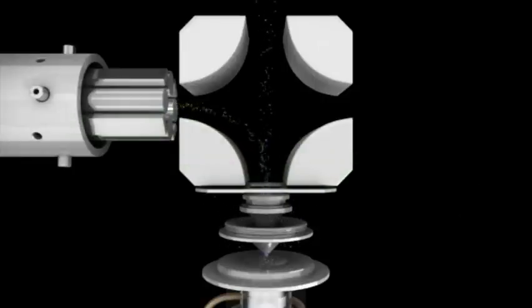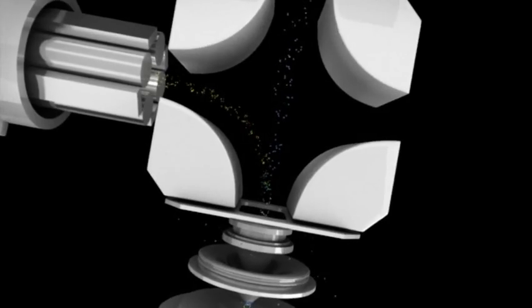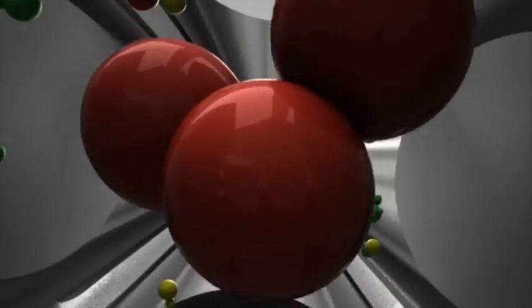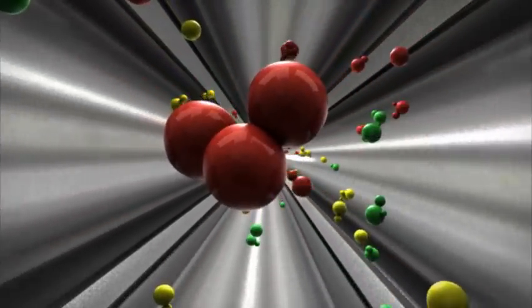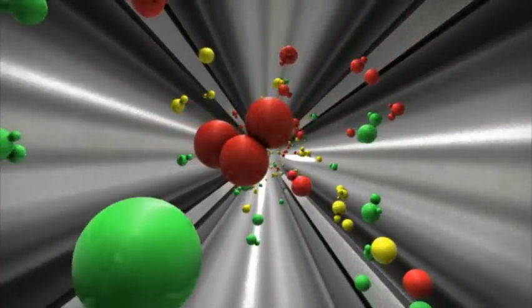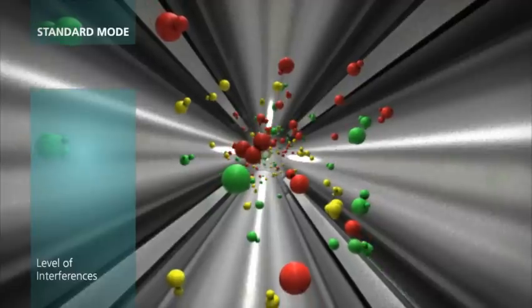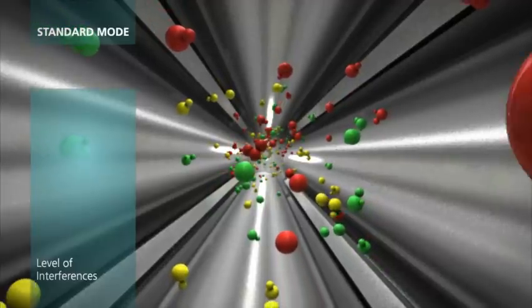The focused beam of ions passes from the quadrupole ion deflector into the universal cell. Depending upon your required level of interference removal and detection limits, the universal cell can be run in three different modes. For high-throughput routine applications, standard mode allows Nexion to operate like a non-cell instrument.